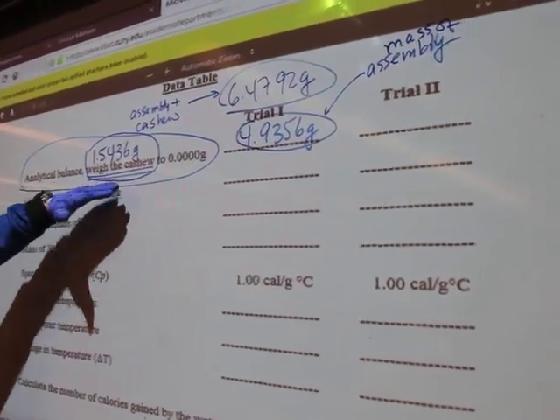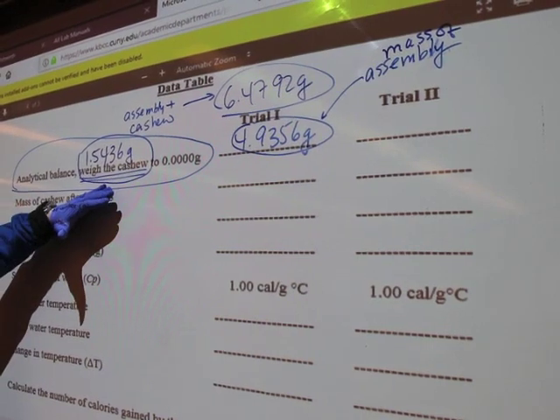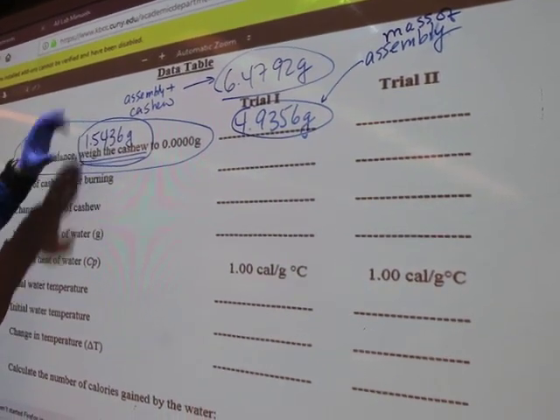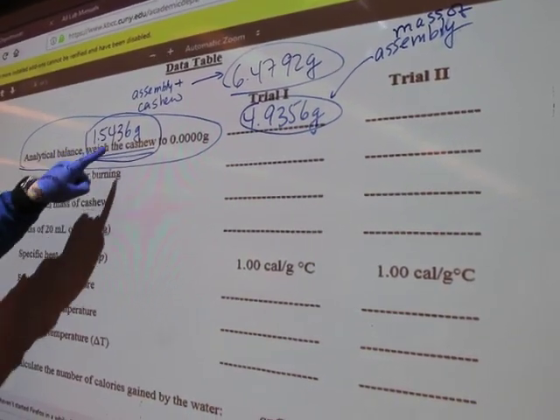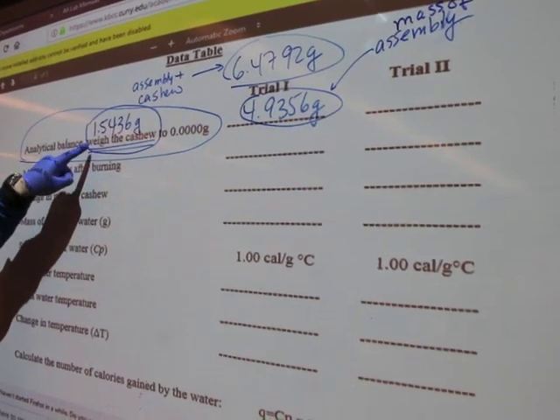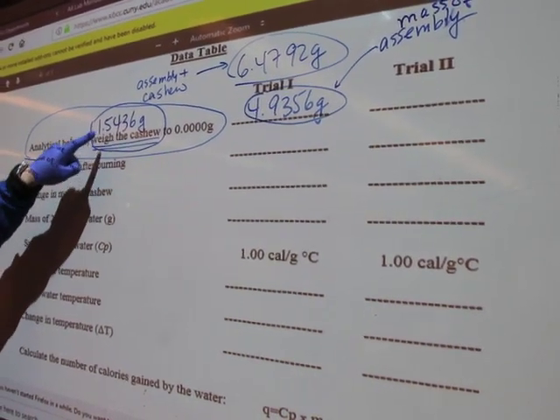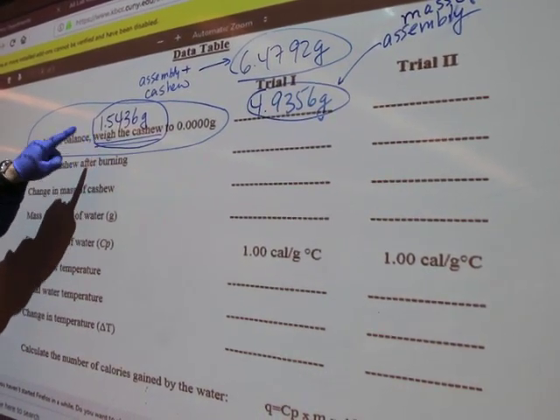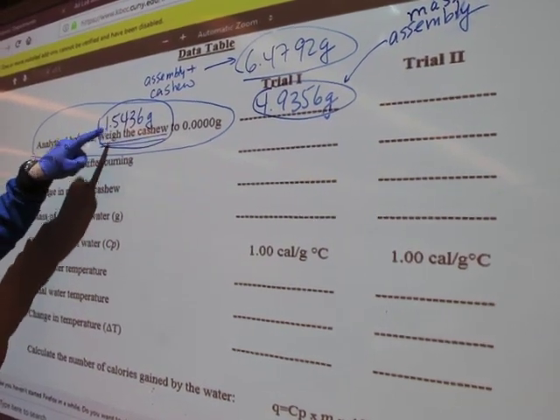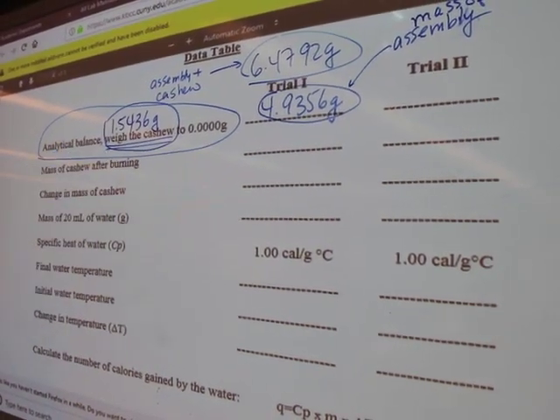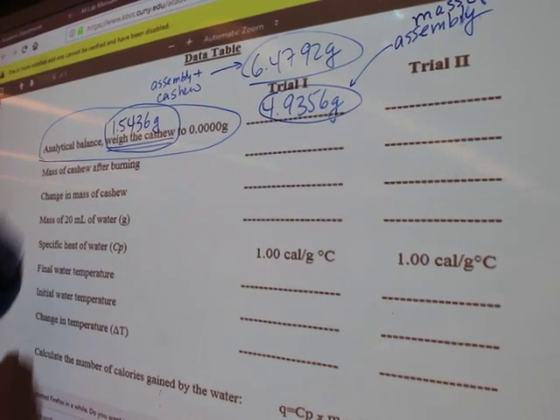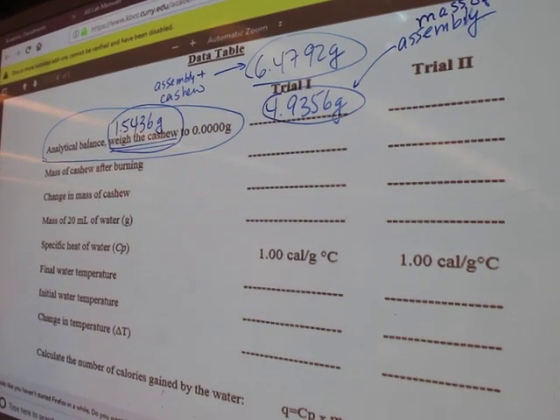We're going to use this mass at the end of the experiment. I specifically put this mass above the term that it represents—it is the mass of the cashew by itself. Now that I completed this step, we're going to the next step.